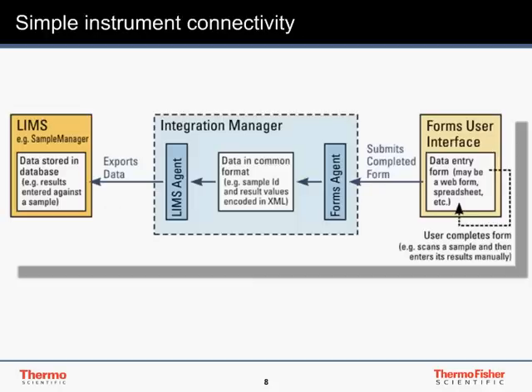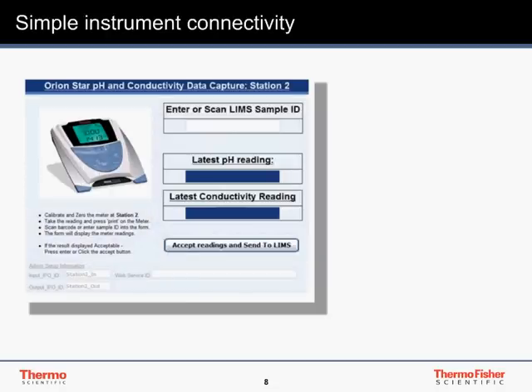Many instruments do not have a concept of sample and test identification. In such cases, a simple form tailored for a specific workstation can provide an easy link to the LIMS. The form identifies the instrument and describes any preparative steps required before analysis. The ID of the sample to be tested is requested. This can be supplied manually or via a barcode reader.